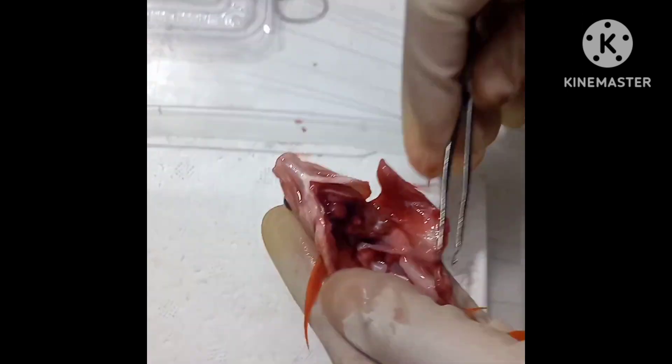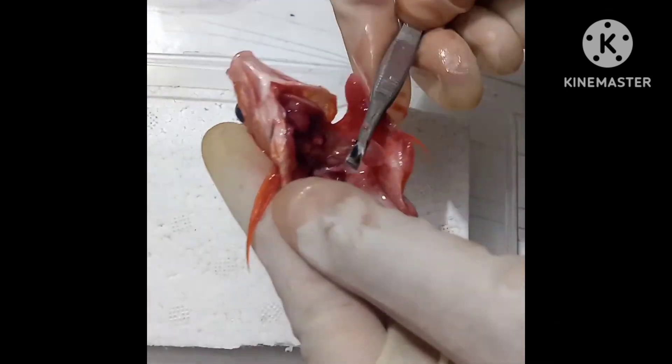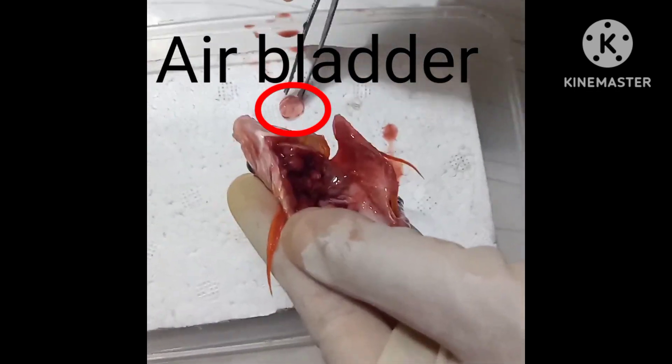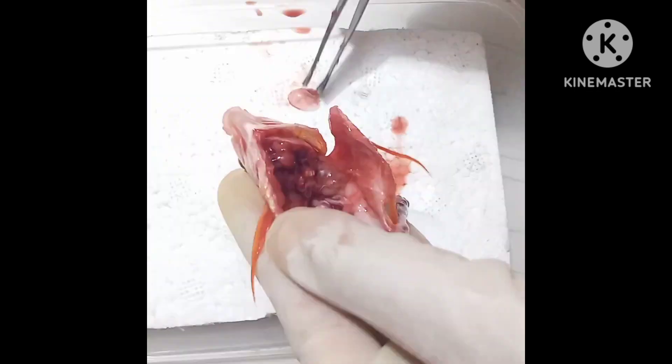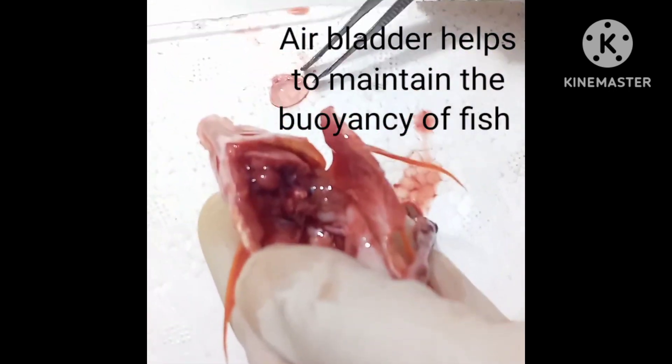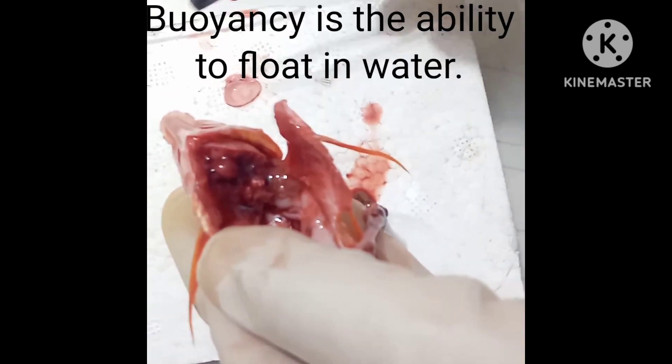This one is its air bladder — it has two sides. Air from one side has been released. The air bladder helps to maintain the buoyancy of the fish. Buoyancy is the ability to float in water.